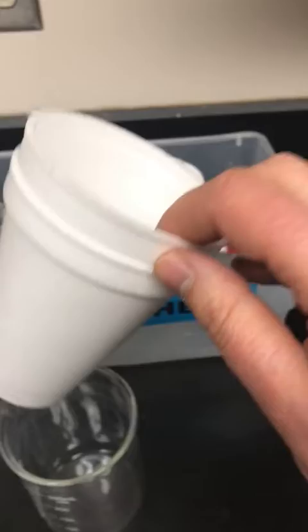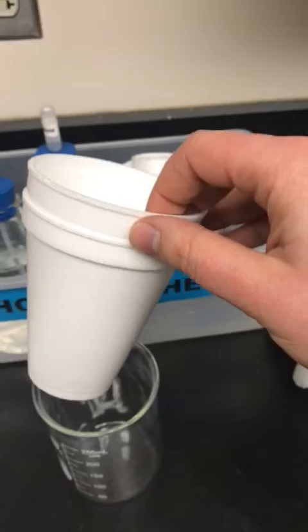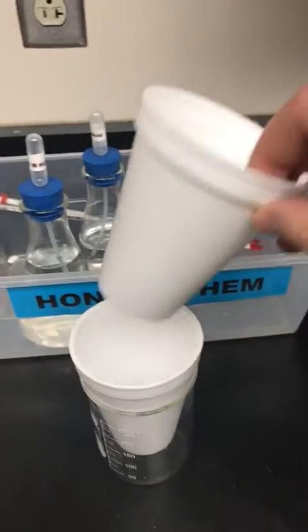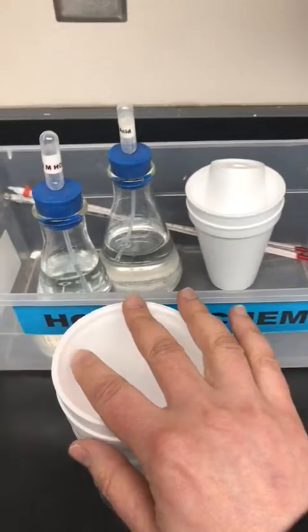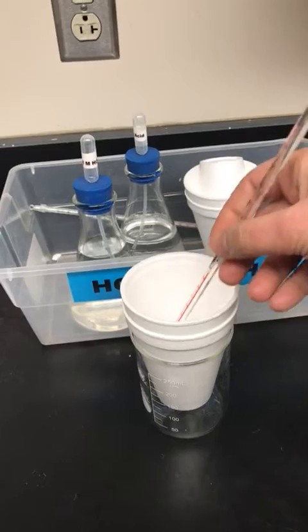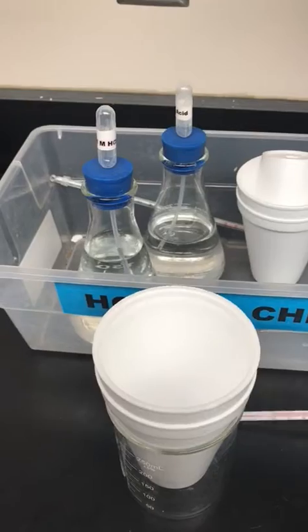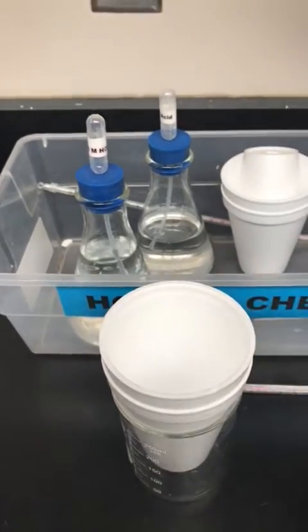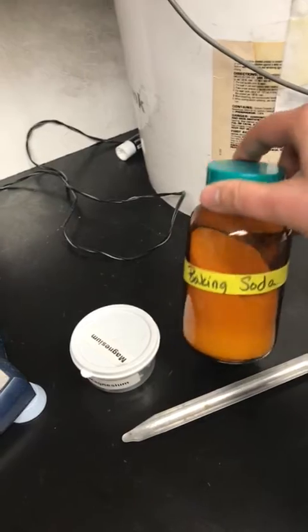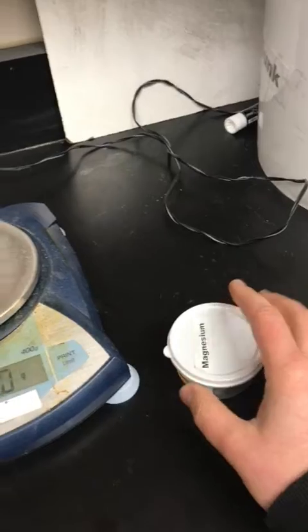Then you're going to take this and mass it again. Again, be consistent. If you massed the whole thing before, mass the whole thing again with the solution. If you only massed the inner cup, then just mass the inner cup with the solution. Then you are going to put a thermometer in here and measure the initial temperature of that solution. Now that you have the measurement of the temperature and the mass, you are going to mass your solid reactant. So if you are doing reaction 1, you're going to mass the baking soda. If you're doing reaction 2, you're going to use a strip of magnesium.